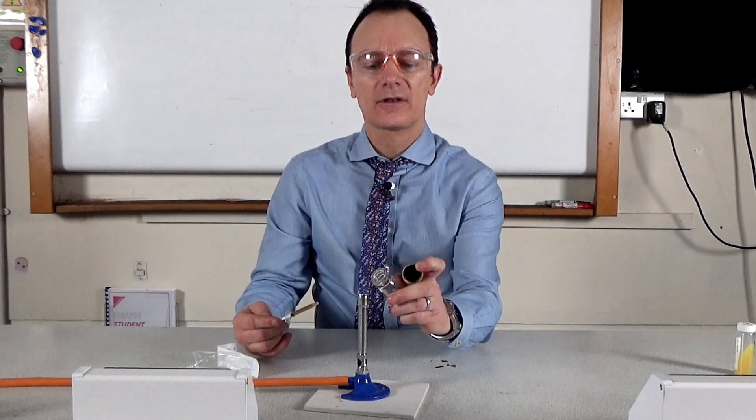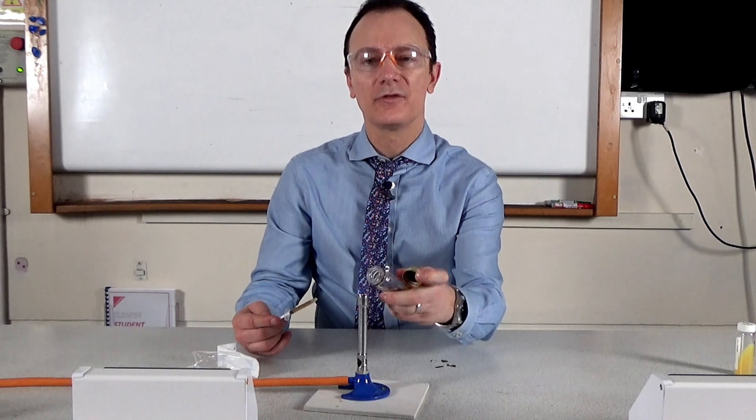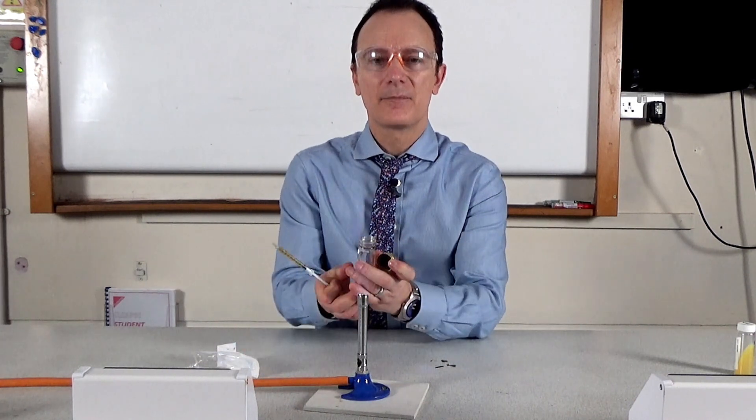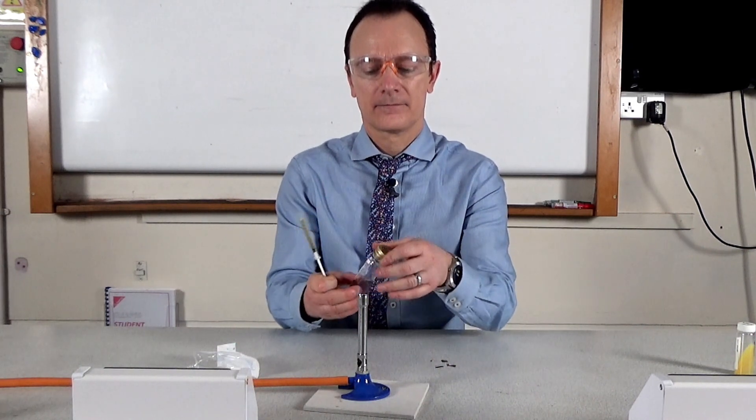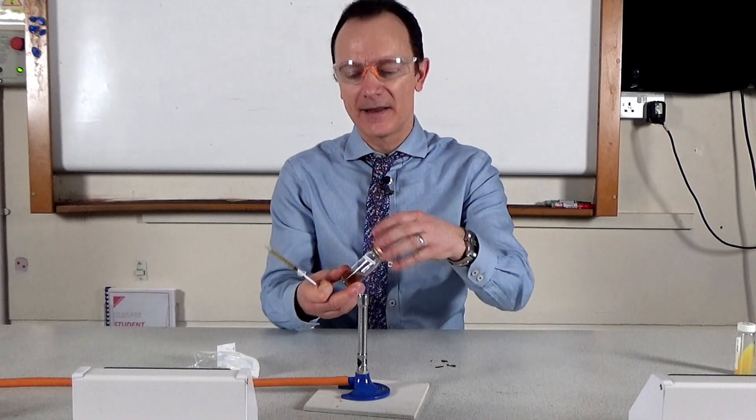Flame the neck of the bottle again by twisting it in the blue Bunsen burner flame, then we place the lid and now the bottle can be placed back on the bench.